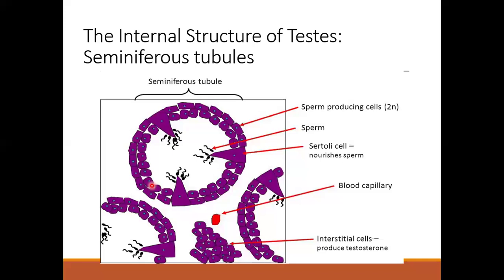And you see that when you take this picture, for example, there's another layer. This layer appears to be a little bit different from the basement one. And then you move on, there will be another layer, which is also going to be different from this one. And then eventually, as you move towards the lumen, they become sperm cells. All right. So these are the germ cells, the immature pluripotent cells that can develop to produce the sperm cells. Now, so they are there. And in between, you are going to have this huge, large, tall cell, which we call the Sertoli cells.